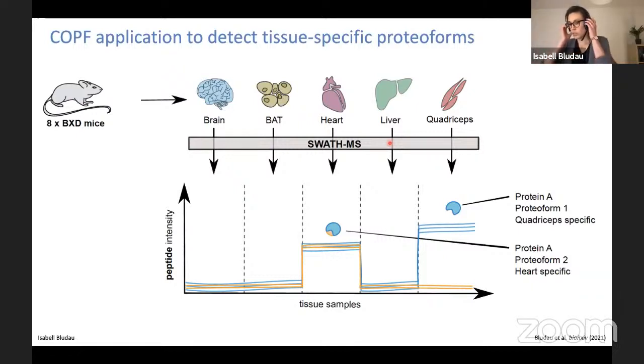And then what was the reproducibility of your peptide detections along experiments? I assume that you're talking about proteoform detection. So this is actually fairly high. As I said, I did this for the different replicates combined, but I also performed initial analyses on each of our replicates and conditions separately. And for the assembly-specific proteoforms that were non-condition specific, we could see a very high reproducibility of the calls across the different samples.